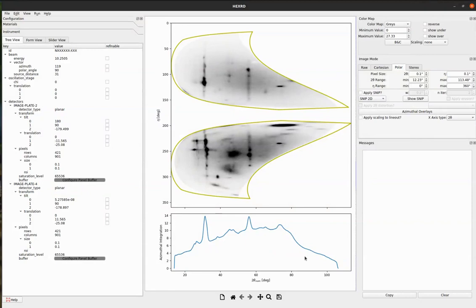For this tutorial, we will be using the TARDIS example to demonstrate some of the masking tools that are available and how they can be used. Often you will have undesirable signals from other layers or other X-ray sources, and in order to remove unwanted signal noise, there are a variety of masking options available.